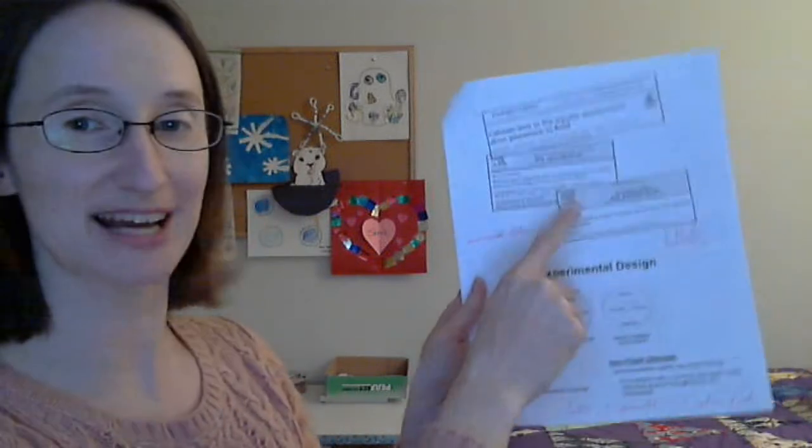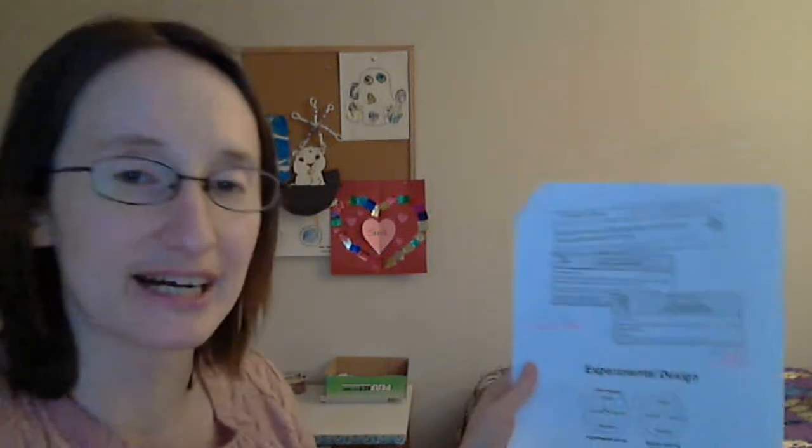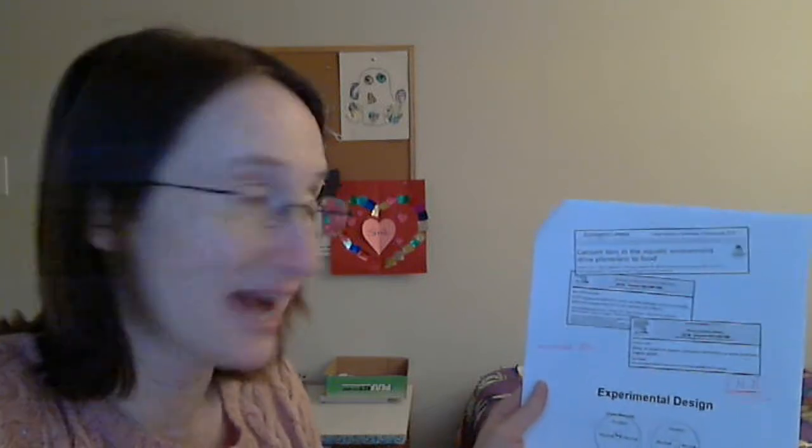Before I get to experimental design, I just want to mention what I have on the top of the page there. We're using planaria. You might think, okay, these are stupid little simple things. Like, do people in real labs use planaria, or is it just something we're doing because it's inexpensive? And what I am trying to stress is that people in real research labs use planaria too.